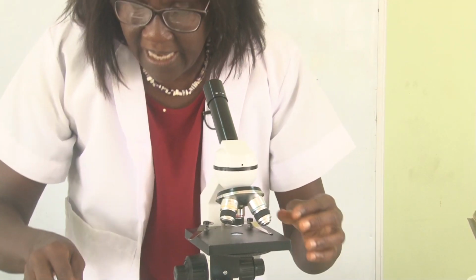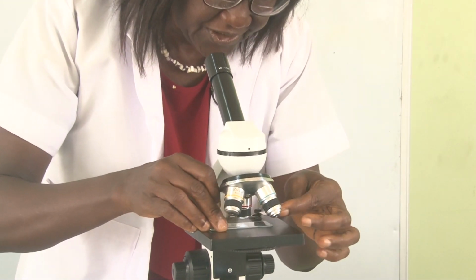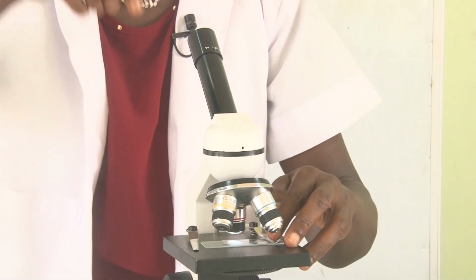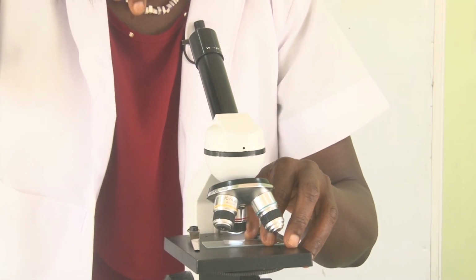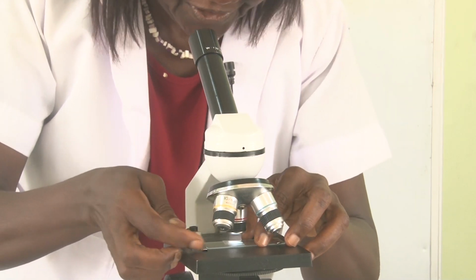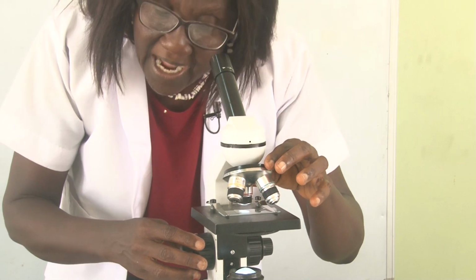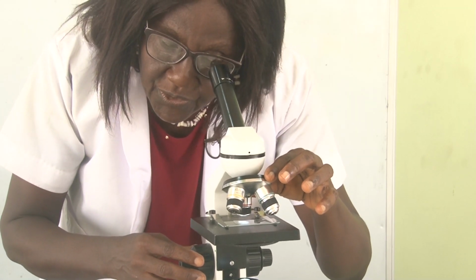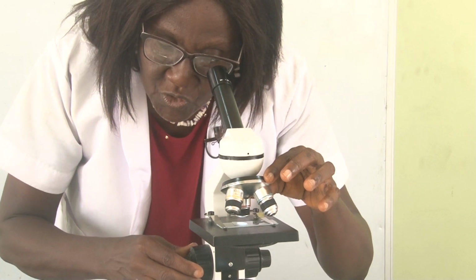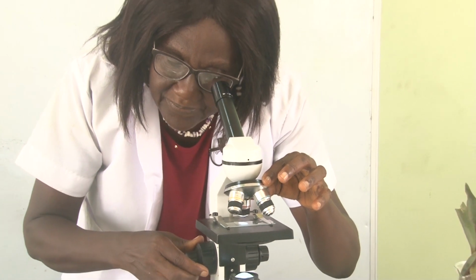Now we put our specimen on the stage, hold it with the clips, and make sure that the specimen is right in the center of the stage. Now you look with your eye through the eyepiece at your specimen as you lower down with the coarse adjustment slightly.